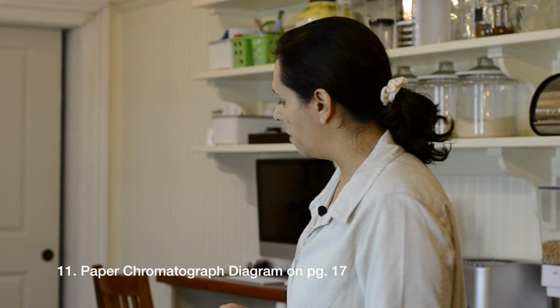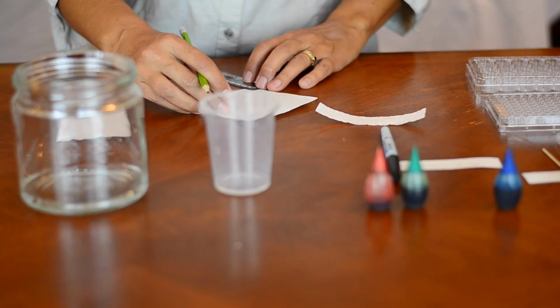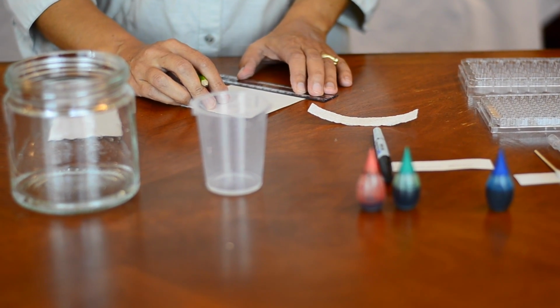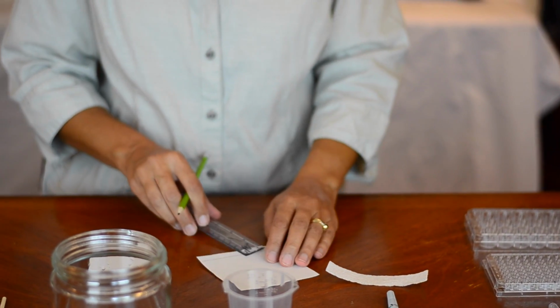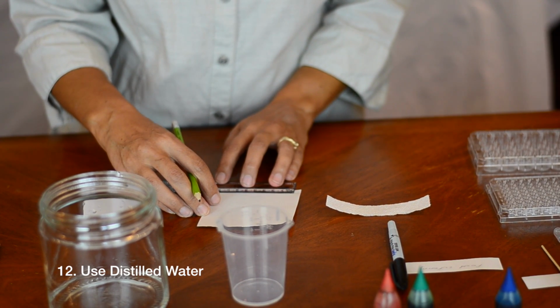So now that our liquid's set up, I'm going to go ahead and set up our paper chromatograph. There's a diagram in your book on page 17 on how to mark your paper, but it's pretty straightforward. We want to draw a line 1 centimeter up from one of the edges. And we're using pencil because pencil is really graphite, which is a non-polar material, so we can be assured that the graphite is not going to get taken up in the water as the water diffuses up our paper. And please be sure that you're using distilled water.